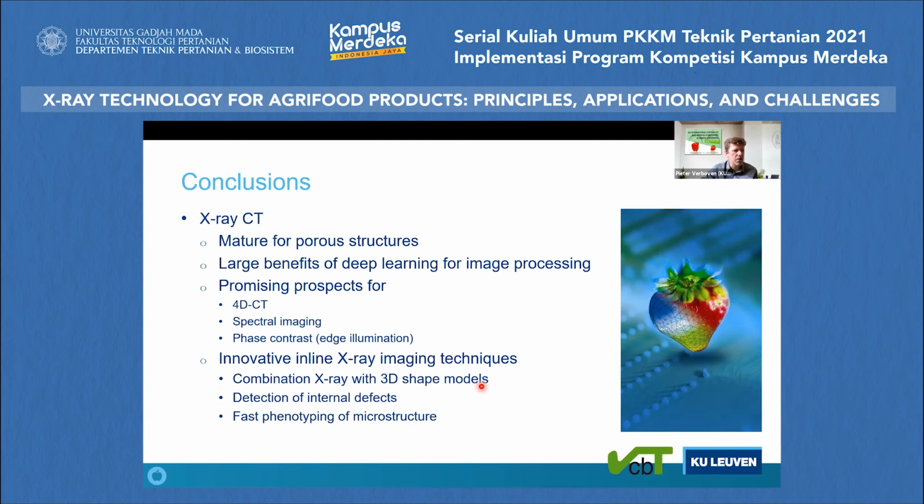And we see that there are innovative inline X-ray imaging techniques. They have promise. They are not there yet, but we see that we are on the right way, and that we can expect in the coming years also some applications in practice of X-ray imaging for detection of internal defects, and even fast phenotyping studies, which I didn't talk about, but that's also a very interesting application.